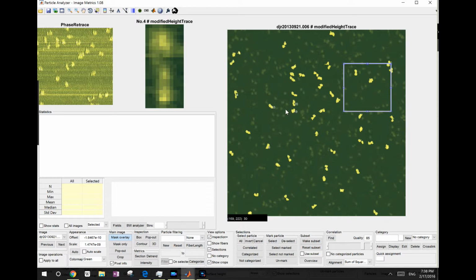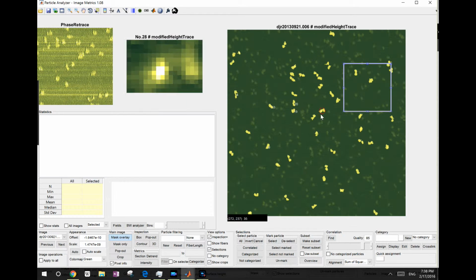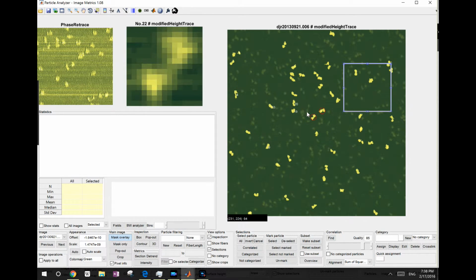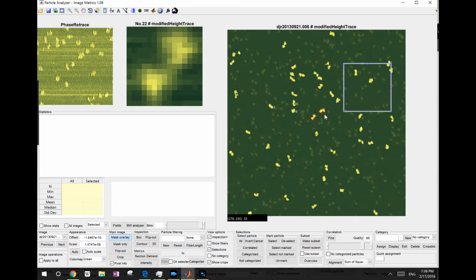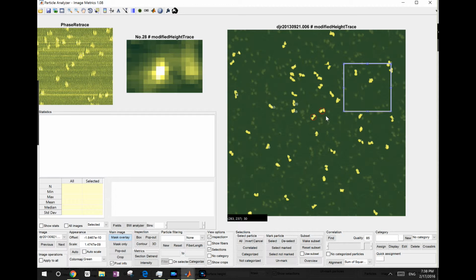It's also true if you mark the particles. For example, you press shift and click the particle, and right now if I want to blow up this particle, if I click right inside the particle mask, then I actually select them. If you don't want that to be the case, you just click the circle, and it will blow up the particle, but you won't end up selecting them.